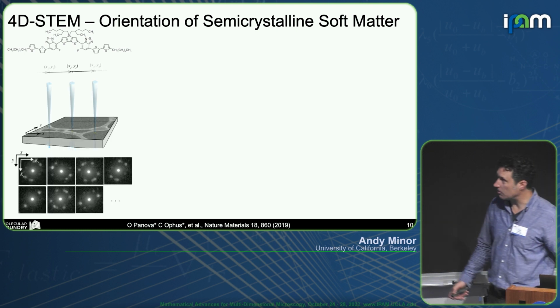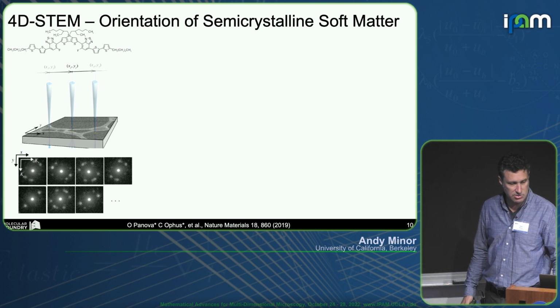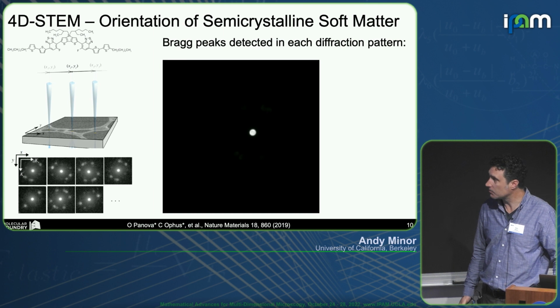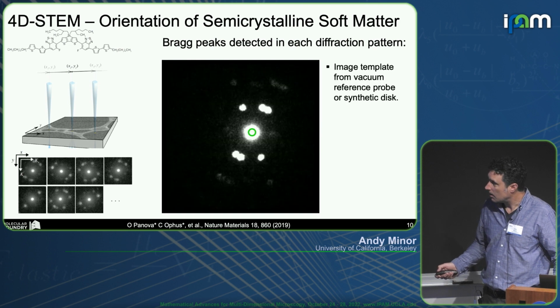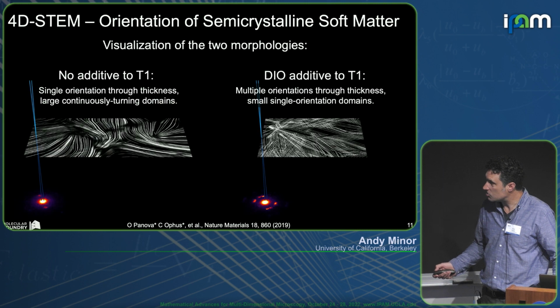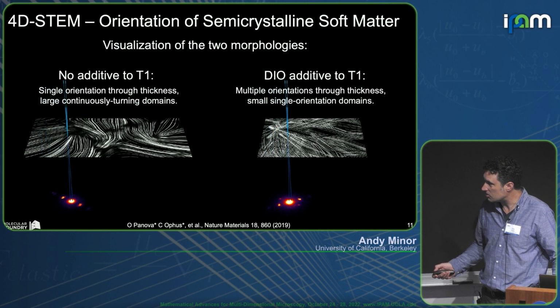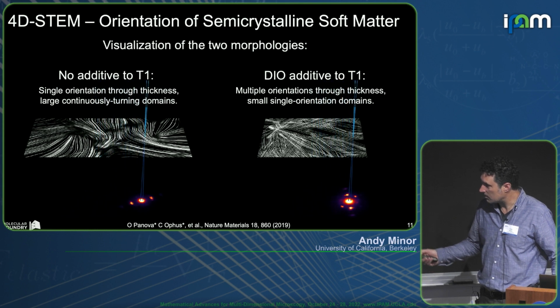Colin talked about this example yesterday where we had a partially crystalline, semi-crystalline organic thin film used for organic electronics. You can see the scattering is very weak, but it's still good enough where you could pick up the spots. And by doing so, and Colin showed this yesterday too, you can have data at each point that you can quantify.